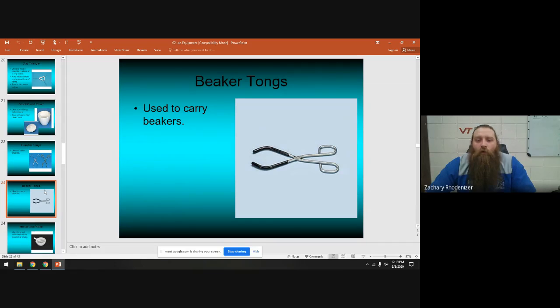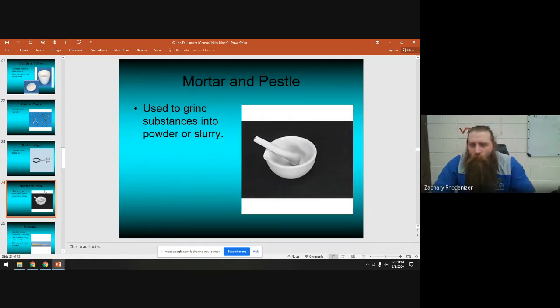Beaker tongs are rubberized — that black material is rubber wrapped around the metal — and can be used to pick up hot beakers and carry them off a hot plate. You don't touch the hot beakers with your hands. Mortar and pestles are used to grind large crystals into a powder. We don't use them very often — usually I'll use them to prep something — but you will see them in the lab.